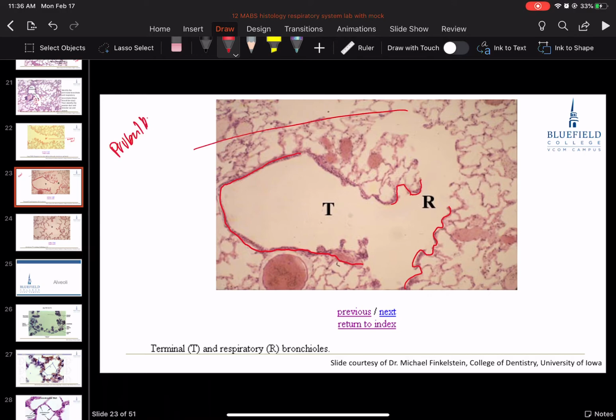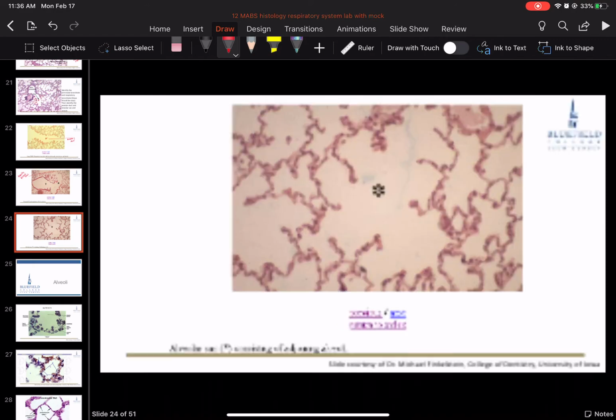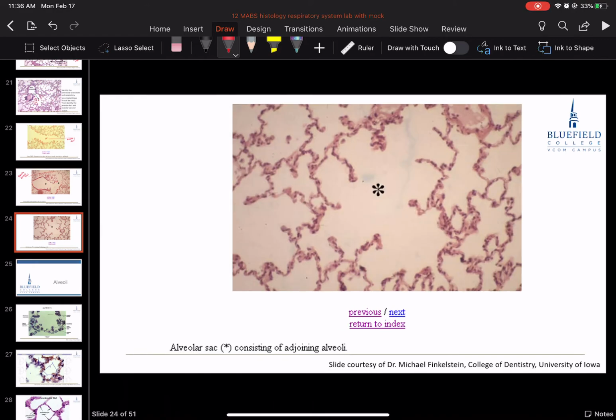All right, what they're telling you right here, they say the asterisk is in an alveolar sac. I won't ask you if I said the asterisk is in a blank. I will not give you both alveolar sac and alveolar duct as a choice. If I take a look though, I go all the way around it, it is thin entirely all the way around it, isn't it? I don't see any sections there where I've got a thicker lining, consisting of a thick epithelium as well as a thick connective tissue. Okay? Everything I see in there is uniformly thin. I don't see any respiratory bronchioles, terminal bronchioles, anything like that. I'm looking at all alveolar duct, alveolar sac, and alveoli.